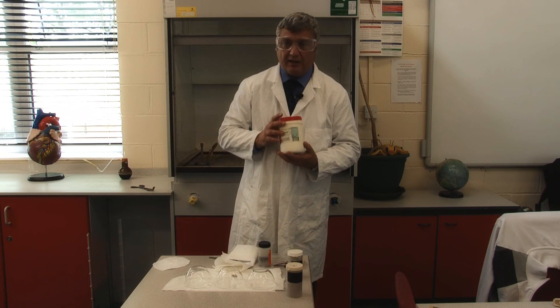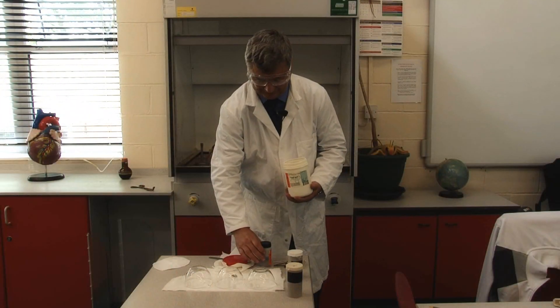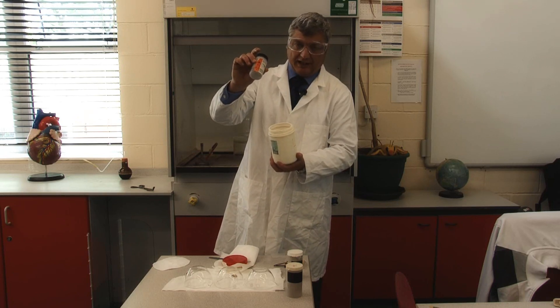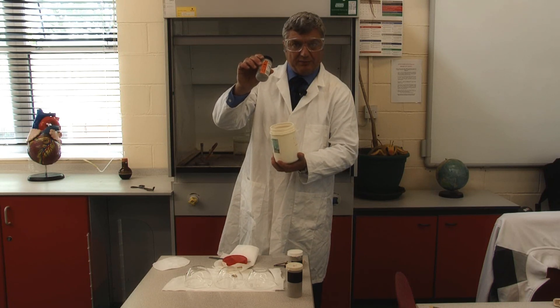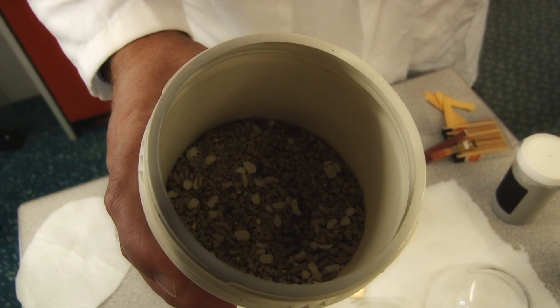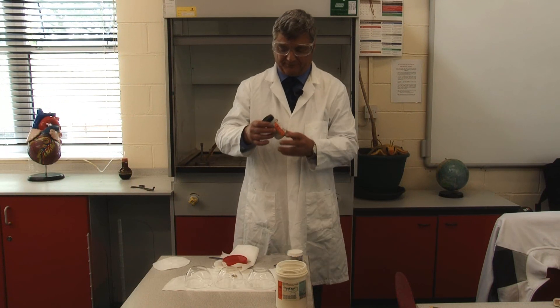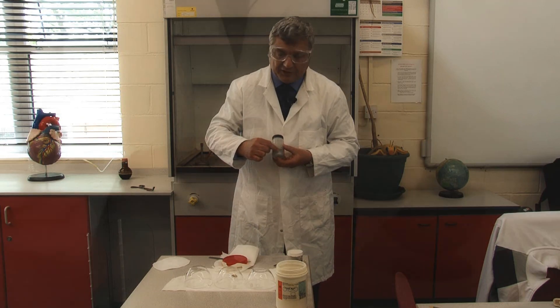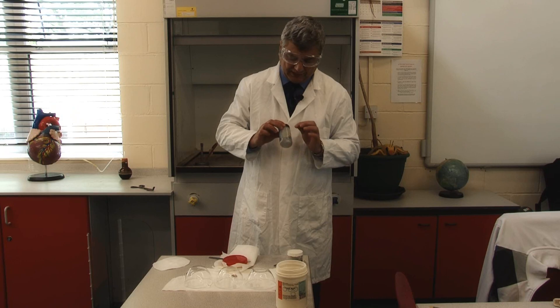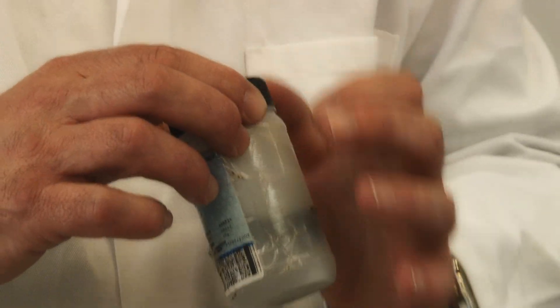The first alkaline metal we'll look at is lithium. Lithium is stored in a large container, and inside that is a smaller container with the actual metal in it. The bottom of the large container is bentonite — if it breaks, the bentonite will absorb the materials. The lithium is also stored in oil in the smaller container, but because lithium has such low density, it floats on the oil.